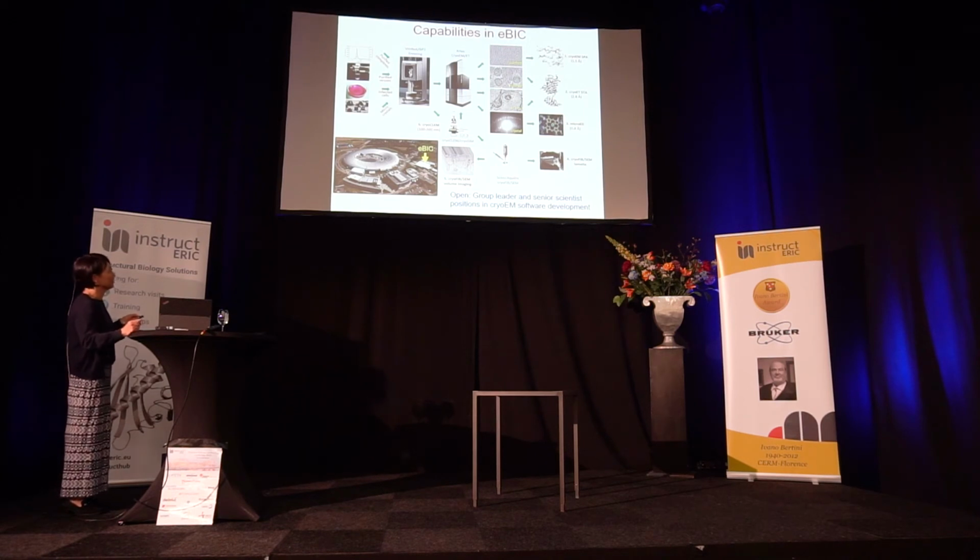We also have other instruments in place. This is a cryo-fluorescence microscope and cryo-CLEM for correlative microscopy and for making lamellae. We also have a FIB-SEM machine to make slice-and-view 3D cryo-FIB-SEM volumes of entire cells in situ.